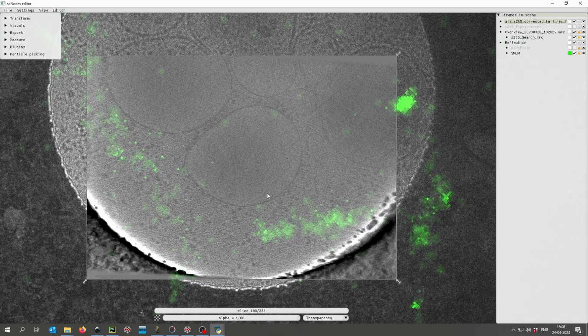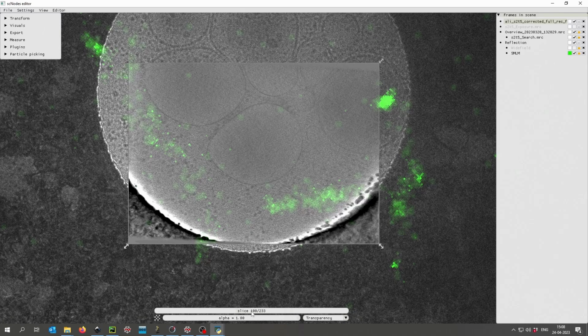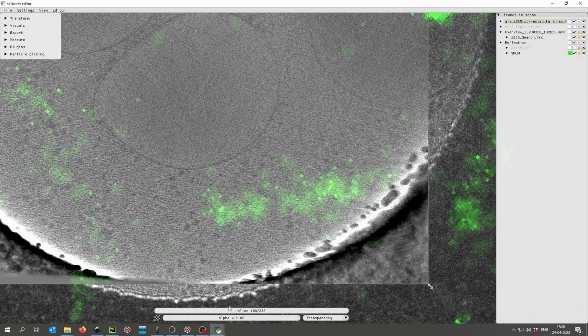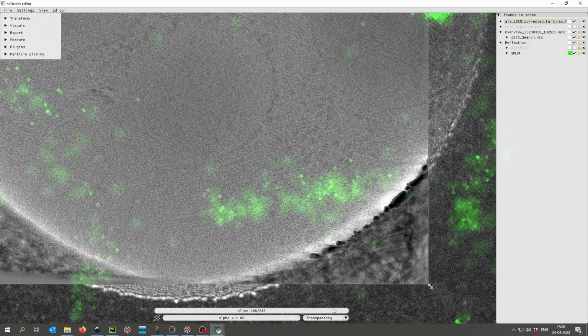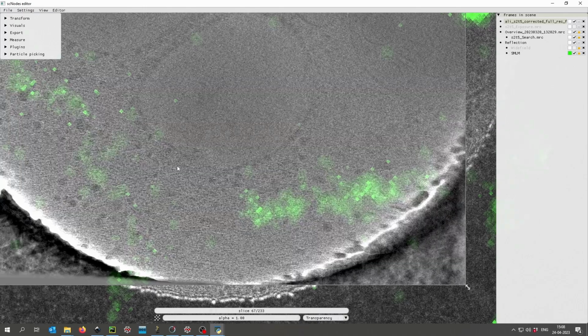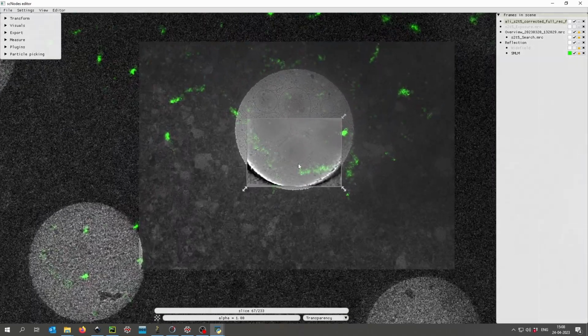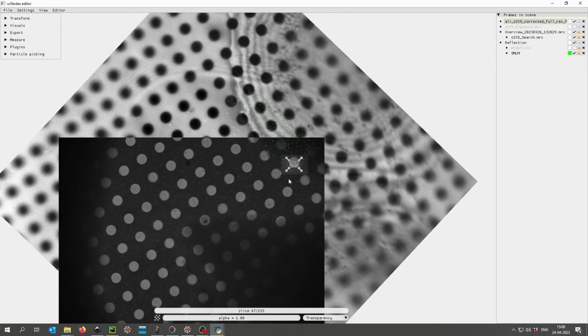And in this case that would point us to this region and this region of the sample where there should be fluorescent label. These samples are HeLa cells with IMPDH2 labeled with rsEGFP2, a blinking green fluorescent protein. And IMPDH2 tends to sometimes form a filament, which is what we were hunting for. Now in this particular case we were a bit unlucky because, as you can see, there is no filament there. But still the tutorial shows the principle of using the correlation editor in scNodes. But do mind the disappointment at the end of there not being an actual filament.